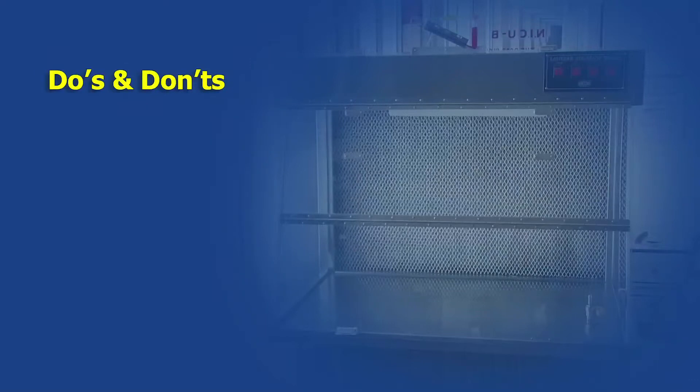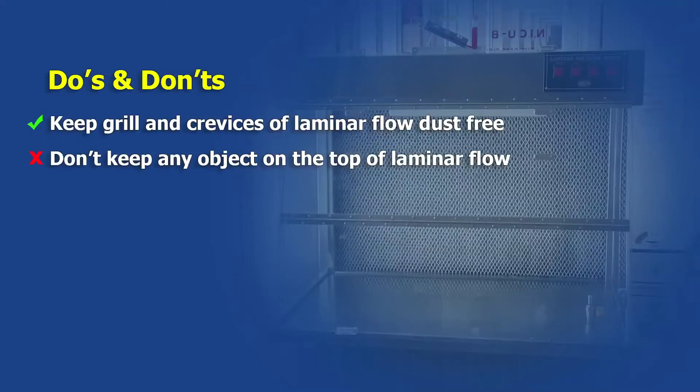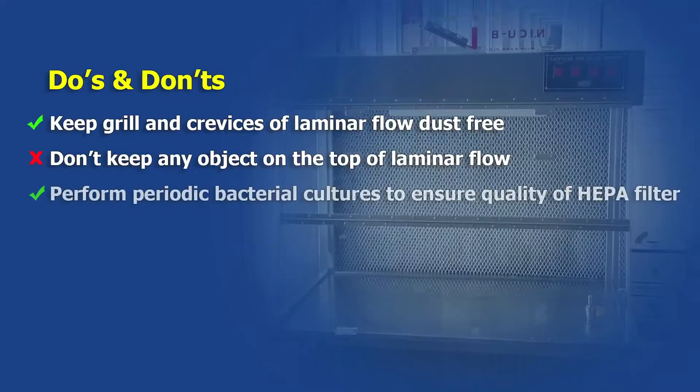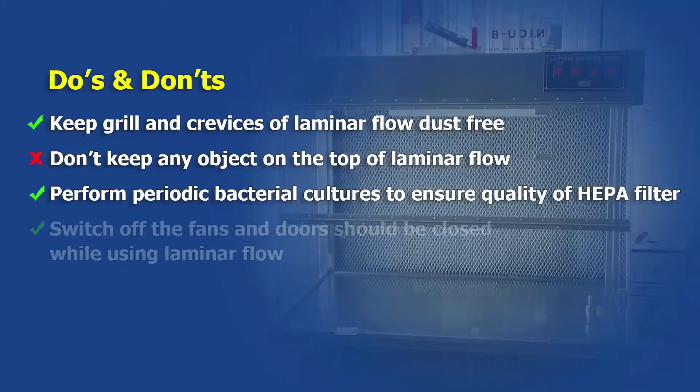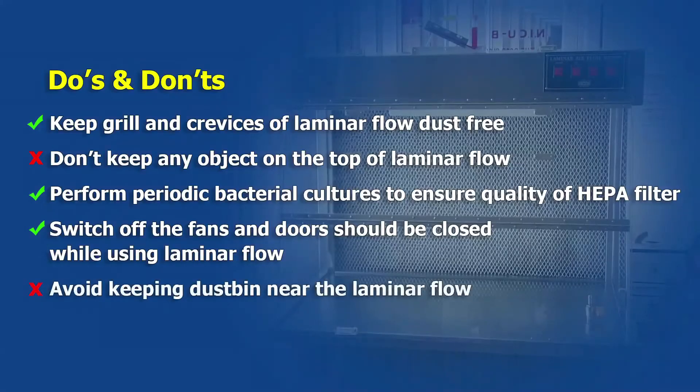Some do's and don'ts: keep the grill and crevices of laminar flow dust free. Do not keep any object on top of the laminar flow. Perform periodic bacterial cultures to assure the quality of the HEPA filter. Switch off the fans and keep the door closed while using the laminar flow. Avoid keeping a dustbin near the laminar flow.